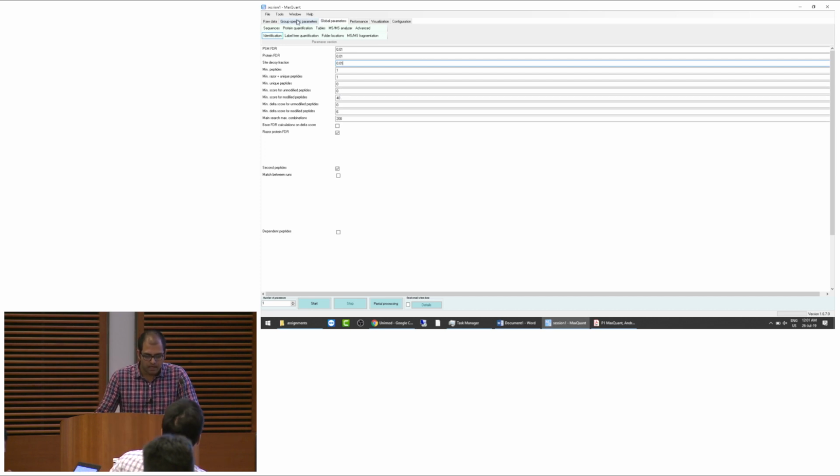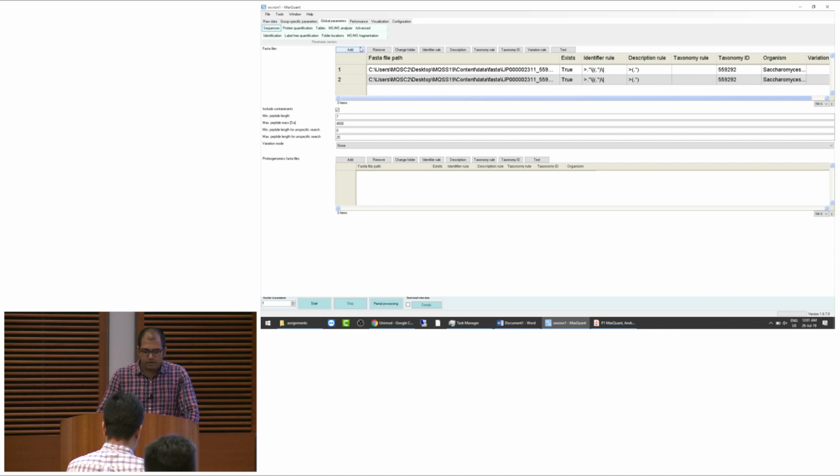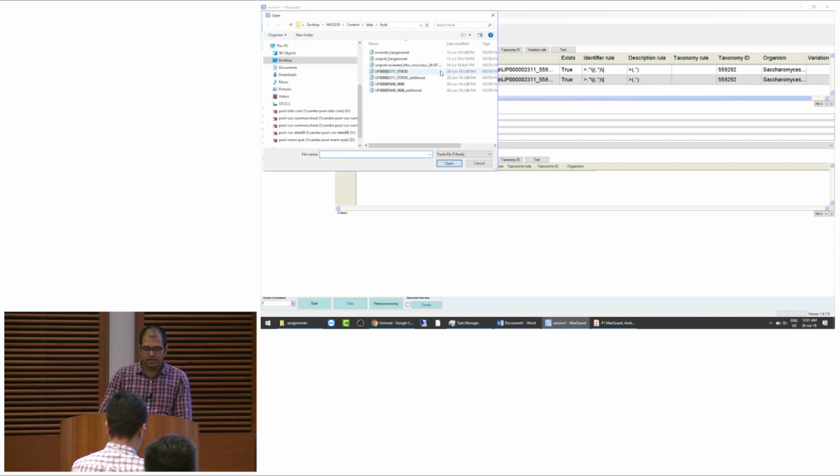Oh, sorry. That is in the data, in the FASTA folder. You will have this 55 92 92. That's the yeast FASTA file. That's the one you use.